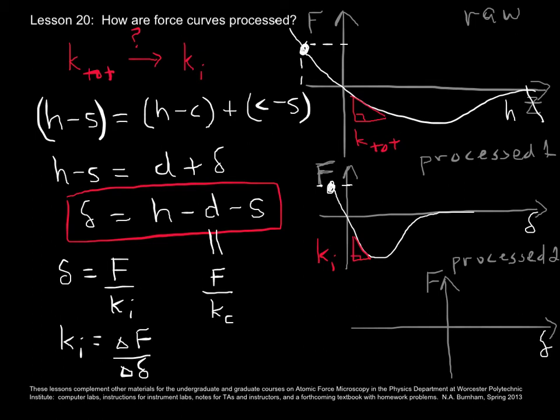There's one more step, and that is we should shift the curve back and forth such that the curve crosses the y-axis at a point that represents the sample surface. So we're going to use Fs as an offset in the red boxed equation. And I like to think of contact beginning here at this inflection point, but that can be difficult to identify.